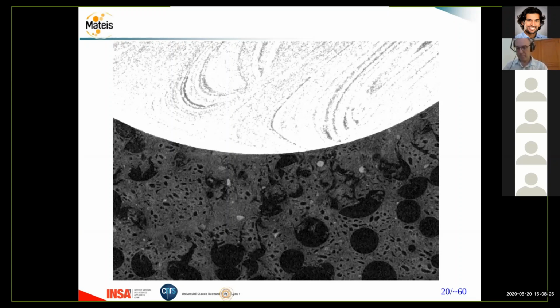Can I ask another question? Yes, sure. It's related to the things that you said about dynamic and quasi-static. For contact, if you have slip, do you think you will be able to track the front of slip, the waves that go into the material because of slip? Well, I don't think so. For contact, you also have to have very high resolution to be able to resolve the contact.